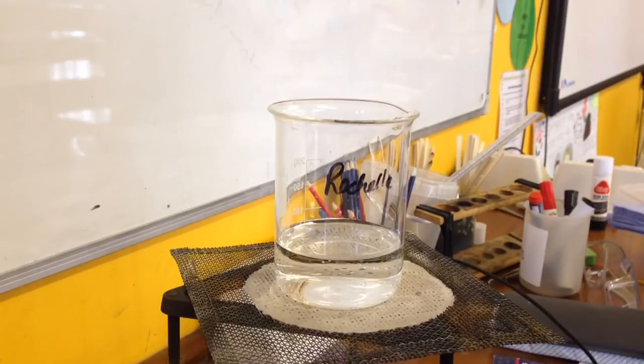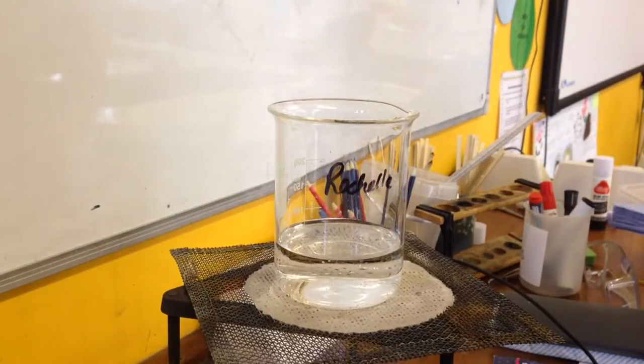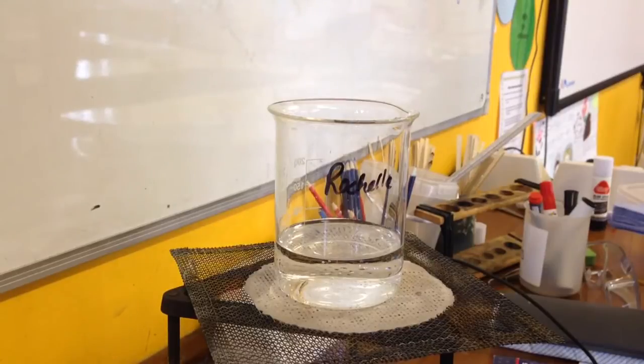The gas that is going to come off is going to be carbon dioxide, starting to happen now. We've got a few bubbles and we can see that the gas is coming off quite slowly. We've got a few bubbles of carbon dioxide coming off there.